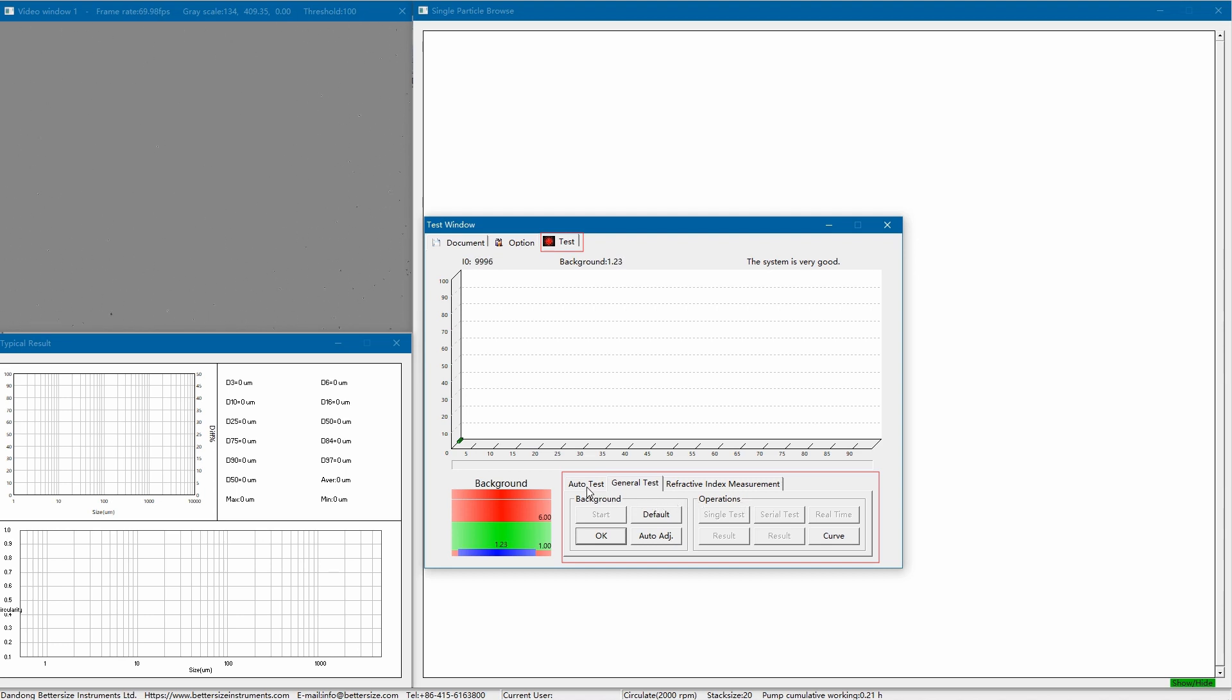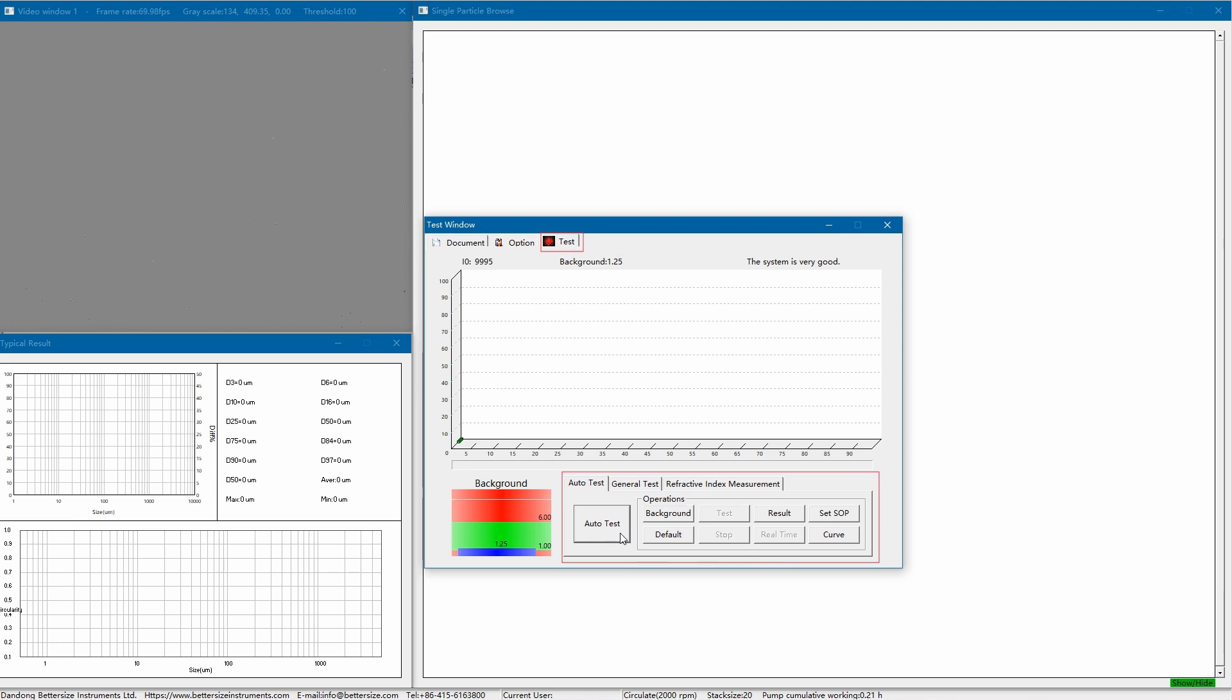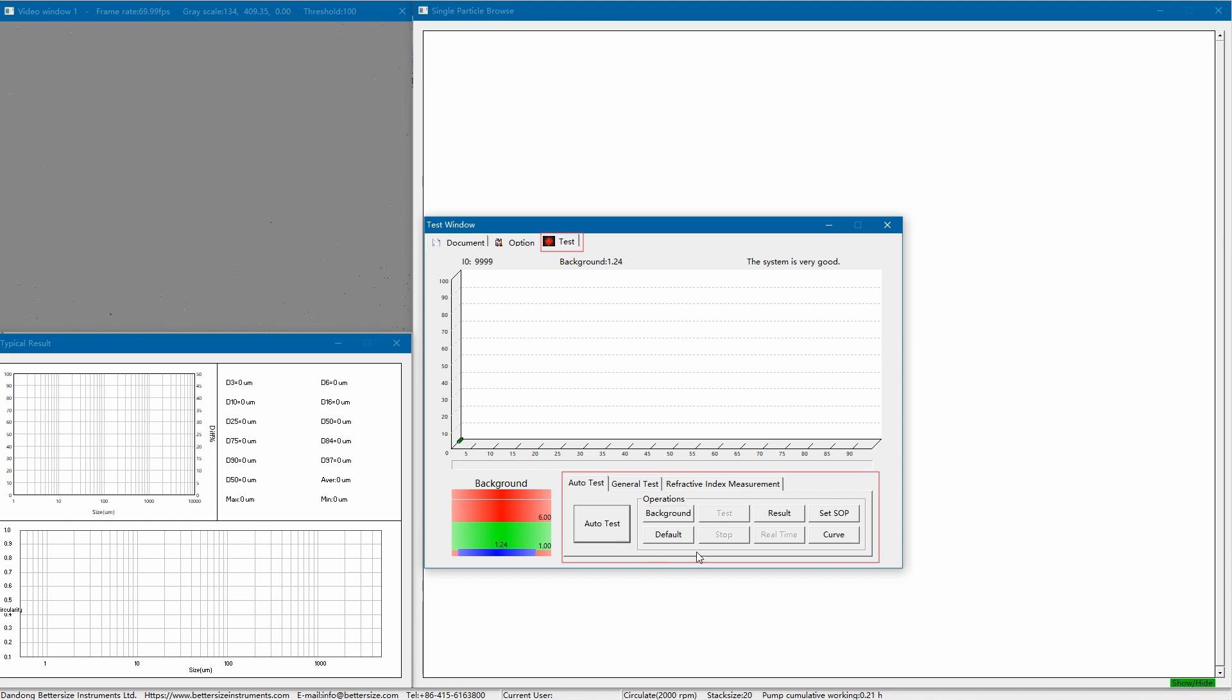As for auto test, as long as SOP standard operating procedure is set appropriately, the auto test function can be used. The advantage of auto test is not only to simplify the operation, and more importantly, to make the measurement results independent of the operator, ensuring the repeatability and accuracy of the results. In this demo, we will use auto test to measure silicon carbide.